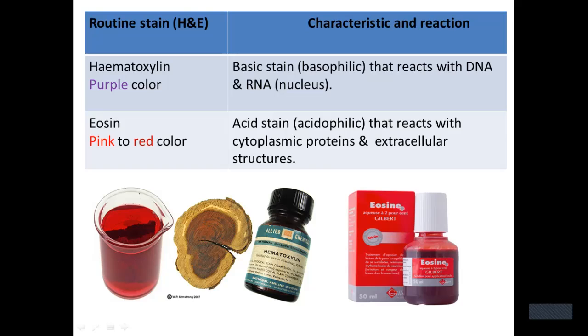This step is very, very important in practical histology for all years. Hematoxylin, purple color, basic stain, basophilic stain, reacts with the nucleus: DNA, nucleolus, and RNA, nucleus, ribosome.